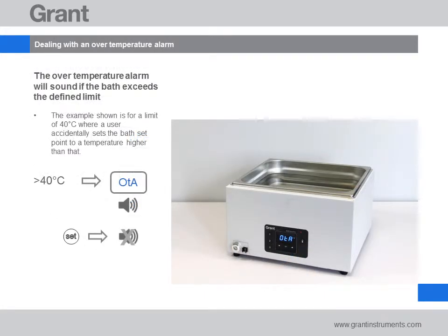If the over temperature value is exceeded, the bath will stop heating, display 'OTA', and an alarm will sound. You can stop the alarm by pressing set. Investigate why the over temperature alarm has been triggered. The bath will continue to alarm while the temperature is above the limit. Either leave the bath to cool or replace the water until the temperature has dropped back to a suitable level. The bath will then return to controlling at the set temperature.